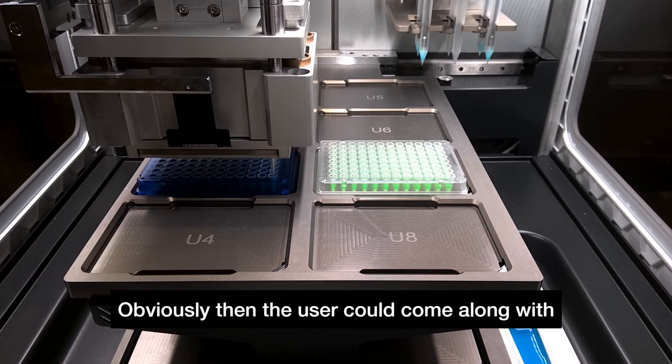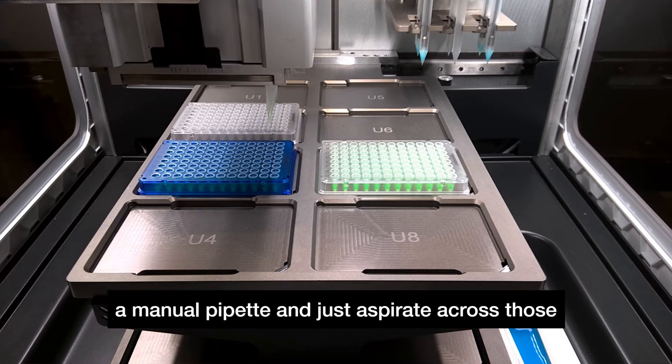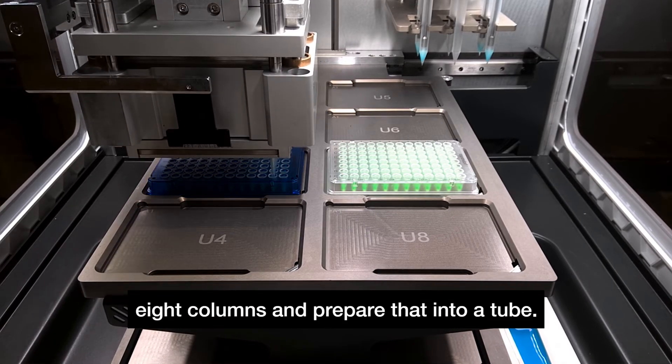Obviously then the user could come along with a manual pipette and aspirate across those eight columns and pipette that into a tube.